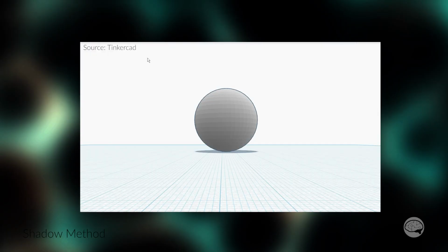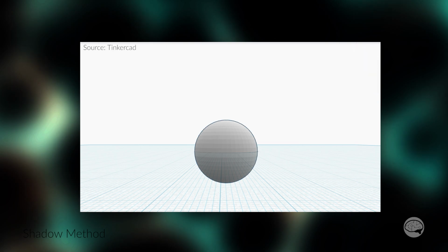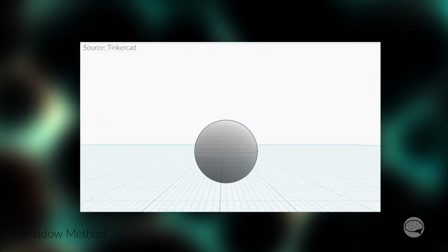And you know what it can't see? The bottom half of this sphere. So the software assumes that the edge of the sphere and the substrate are in contact with one another. So you might get a decent looking sphere shape, but it will only be the top half of the sphere, meaning that the Z height will be 50% of the diameter, which is kind of hilarious, but it makes sense when you think about it.